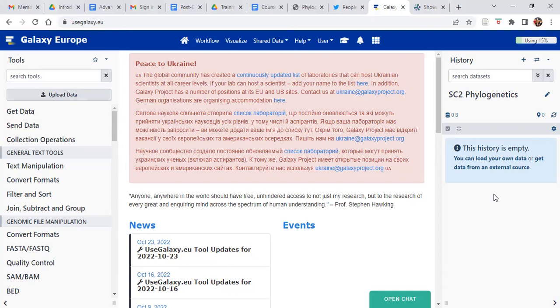From there, we will be able to build a phylogenetic tree using IQ-TREE. Once IQ-TREE is done, we have the file we need in order to view everything in Microreact. Let's start with that.